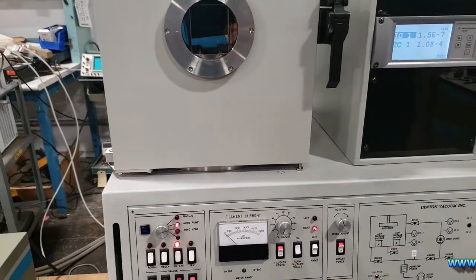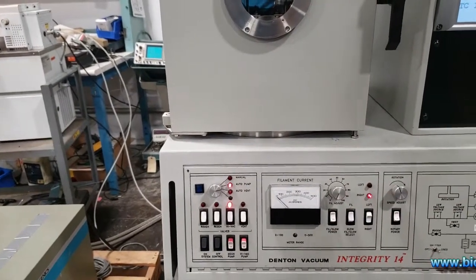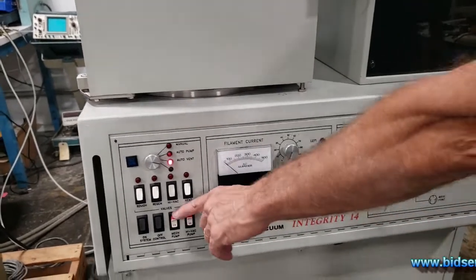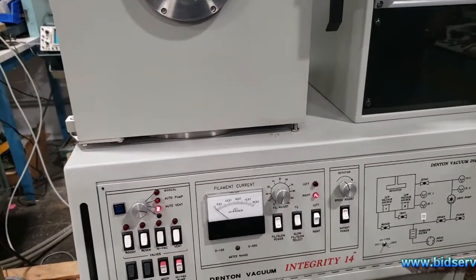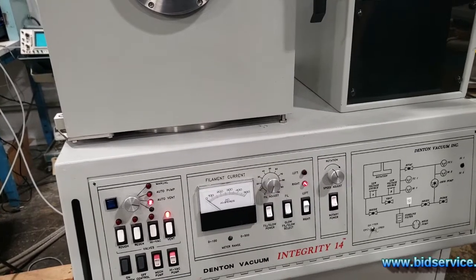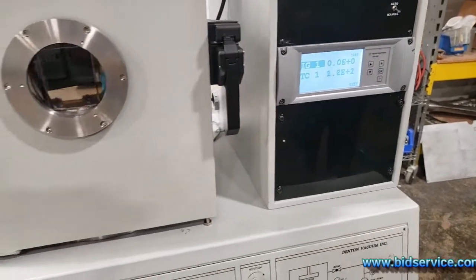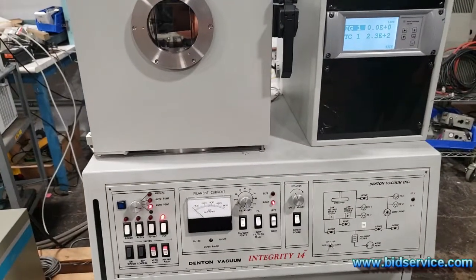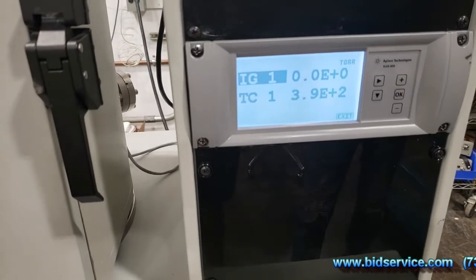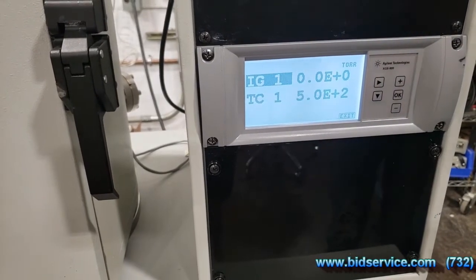Once you're done with your deposition, shut your rotation off and shut the power off. We'll do an auto vent — it'll close the high-vac valve and open the vent valve automatically. You'll see the ionization gauge one shuts off, and TC1 monitors the pressure inside the chamber. I don't have nitrogen hooked up, so it'll take a little longer — it's just pulling in atmosphere through the open vent port.